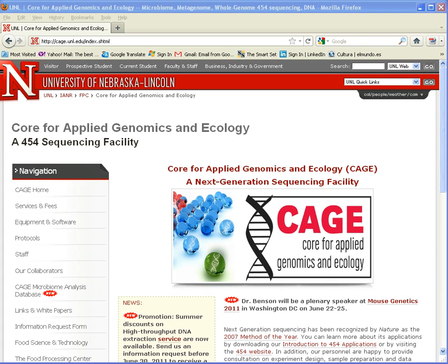The Core for Applied Genomics and Ecology at the University of Nebraska-Lincoln provides 454-based next-generation sequencing services to its clients and uniquely offers a microbiome analysis database designed to accommodate the client's 16S data in a user-friendly format. In this video, I will demonstrate how to use this database.